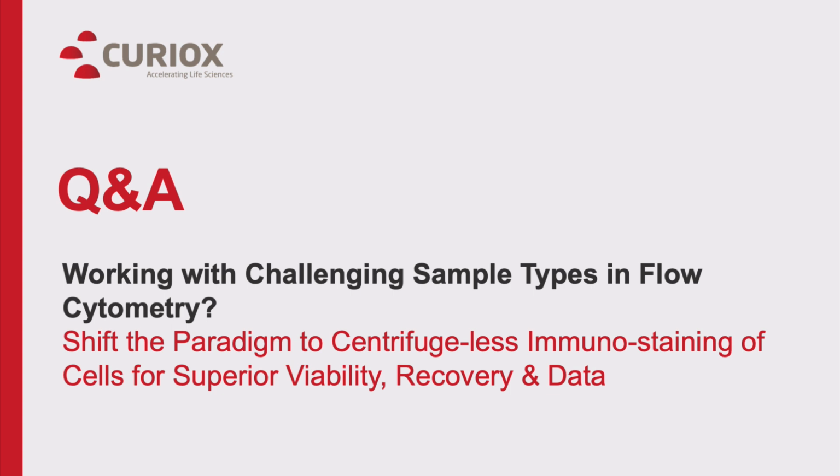There is a little asterisk to this: centrifugation speeds and times. Any recommendations, I think, is the question. At this particular point, I don't really have any recommendations for speeds and times on a centrifugation. Again, it's going to depend on the types of iPS cells that you're working with and what sort of shape they're in. I mean, if you're concerned, I would probably say, you know, less is better. Timing wise, and in the RPMs or G-forces that you apply to those cells, again, they can range. You would have to test those out for the iPS cells that you're interested in working with.